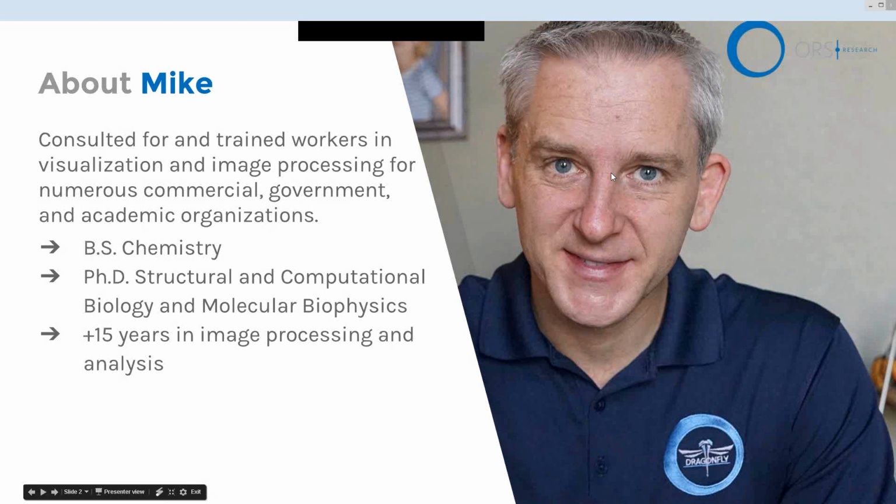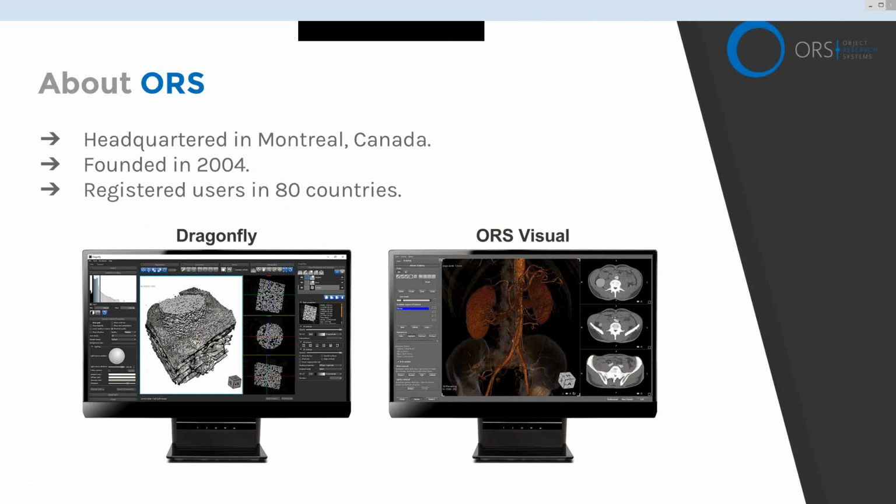My name is Mike. I've been working in 3D visualization and image processing for a little more than 15 years. My background is in TEM microscopy, but I've been working in application areas with scientists on micro-CT and FIB-SEM for almost a decade. So I have a pretty good idea of a lot of the workflows and data types people need to deal with. I'm happy to address questions on your particular applications at the end of the presentation.